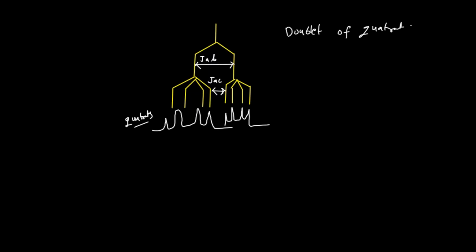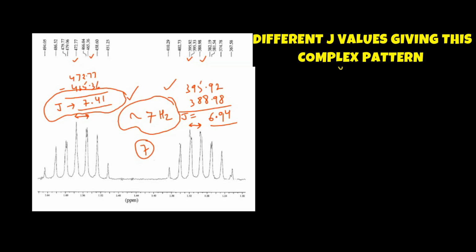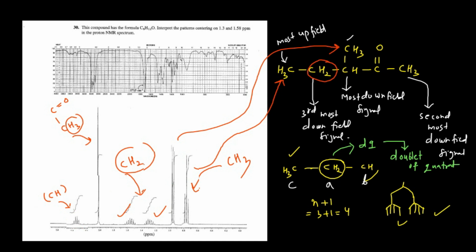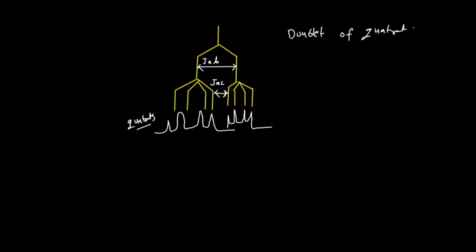These lines we have calculated theoretically. So somehow we are very close to this particular pattern, but not exactly. But this is the only possible way by which you can get this particular pattern of the peaks. There is no other way to get this pattern. Please remember. Now if I go back, this CH, why are we getting this peak? If I go to the expansion of this one, 1, 2, 3, 4, 5, 6, total 6 peaks I am getting.